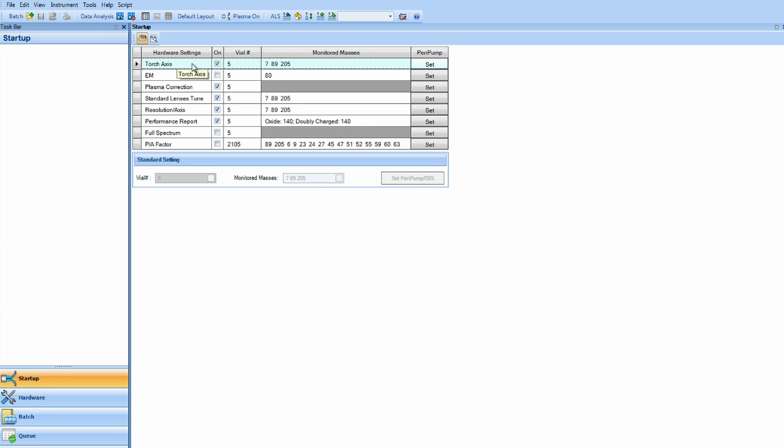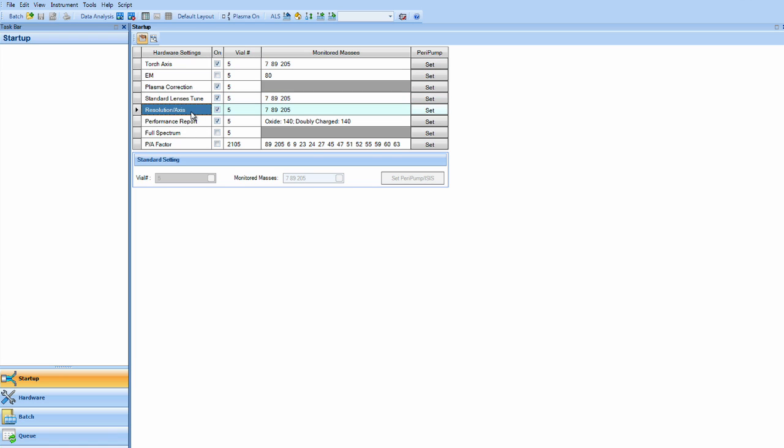Those parameters are the torch axis, which is the horizontal and vertical torch positions, the EM, which is the electron multiplier detector, the plasma correction or HMI correction, the lenses, the resolution axis or peak shape, performance report on the Agilent 8800 factory specs.